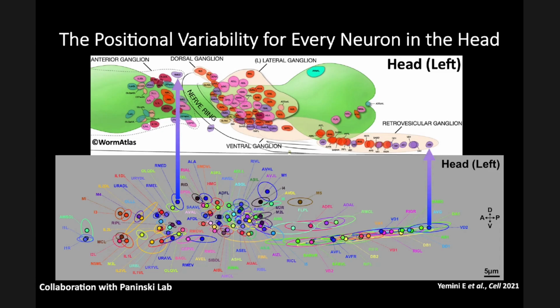So it depends what you mean by that. If I interpret that question as how long did it take me to figure out how to color these worms to get that barcode, that was the biggest part of this project, in the sense that I thought I could do it with just 4 reporters. Then I was like, I need more reporters. So I brought in more. By the time I reached 20 reporters, I'm like, oh, I'm running out of reporters to work with.